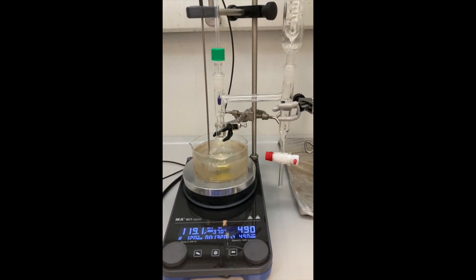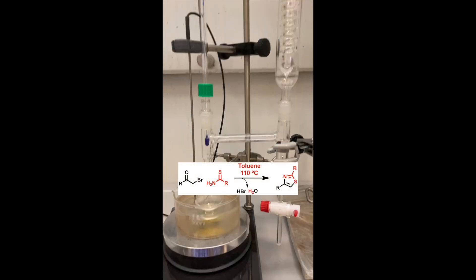I set up a Hantzsch-type reaction. In this transformation, I wanted to unite these two fragments to generate a thiazole ring. To this end, a mixture of the thiamide and the bromoacetone in toluene were refluxed overnight.